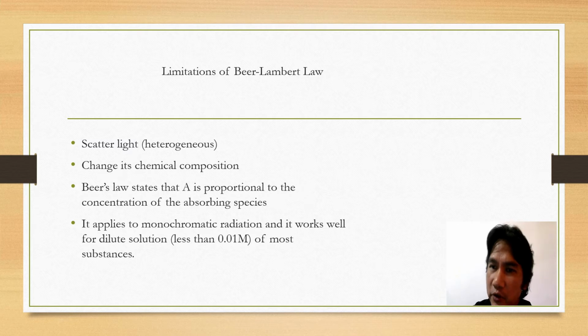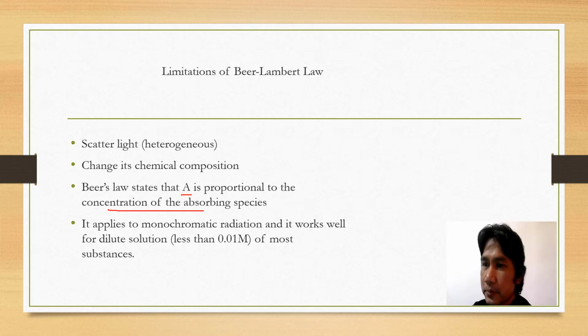Beer's law states that absorbance is proportional to the concentration of the absorbing species. The more concentrated, the higher the absorbance. The less concentrated, the lower the absorbance. Beer's law works well for dilute solutions.